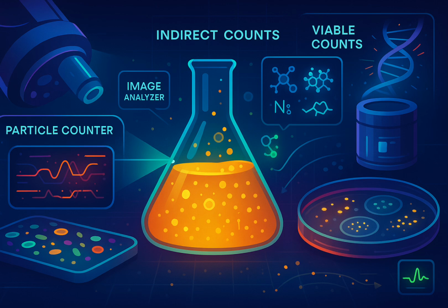Okay. Yeah. What about flow cytometry? That sounds even more high-tech. Flow cytometers are definitely sophisticated. Again, you suspend cells in liquid, but here they flow single file, like really fast, through a narrow tube. One by one. Exactly. Past a laser beam. As each cell crosses the laser, it scatters light. Detectors pick that up. Just scattering? Well, that's the basic count.